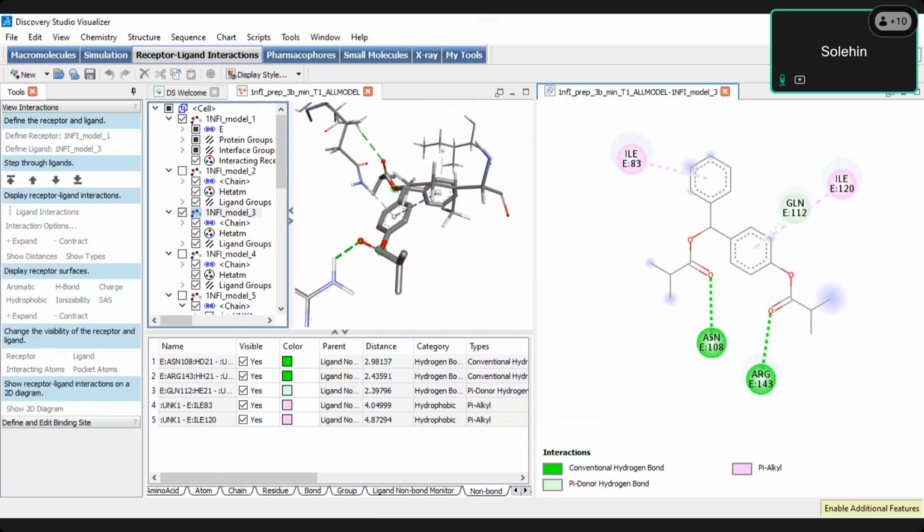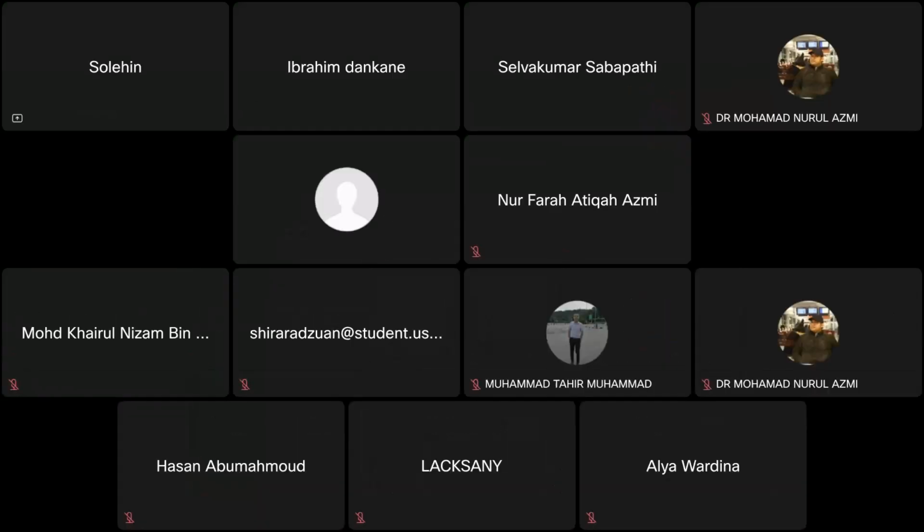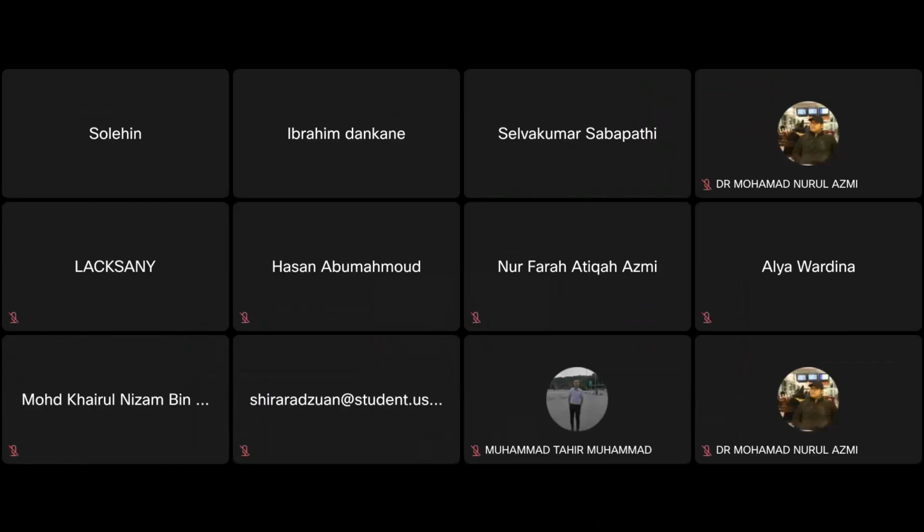Okay, I just minimize this one. Oh shit. Did it explode or not? Wait, I need to show you. Okay.